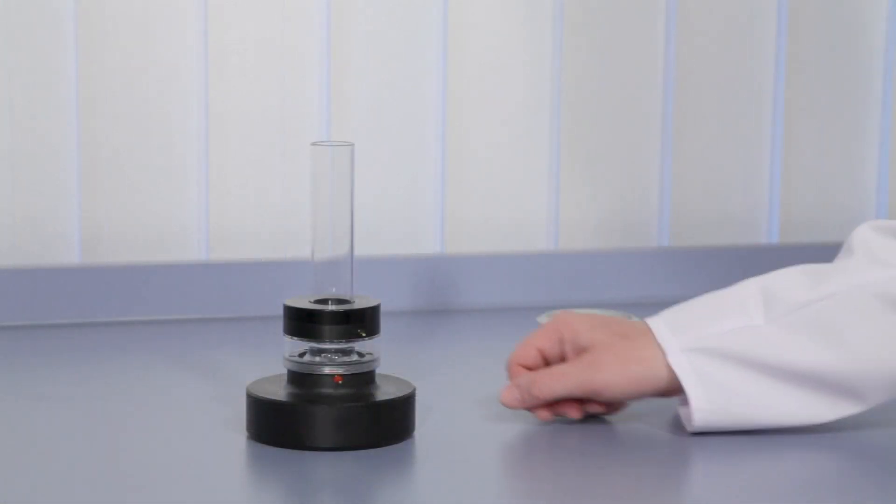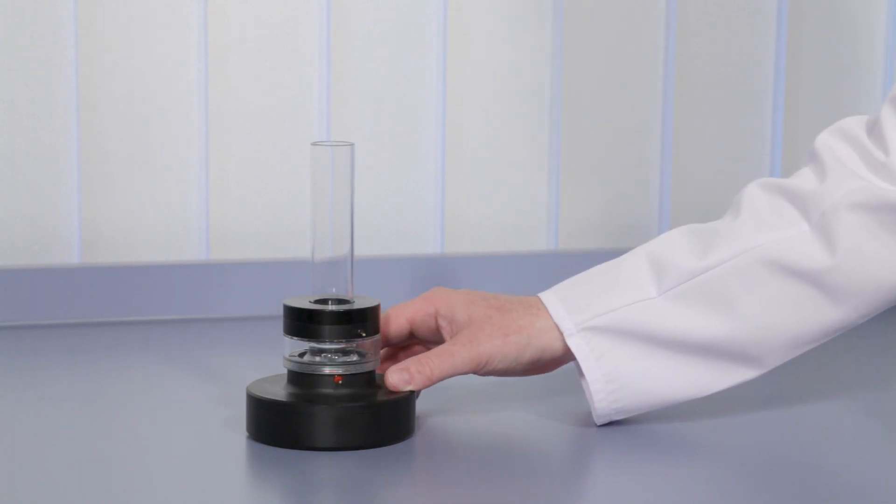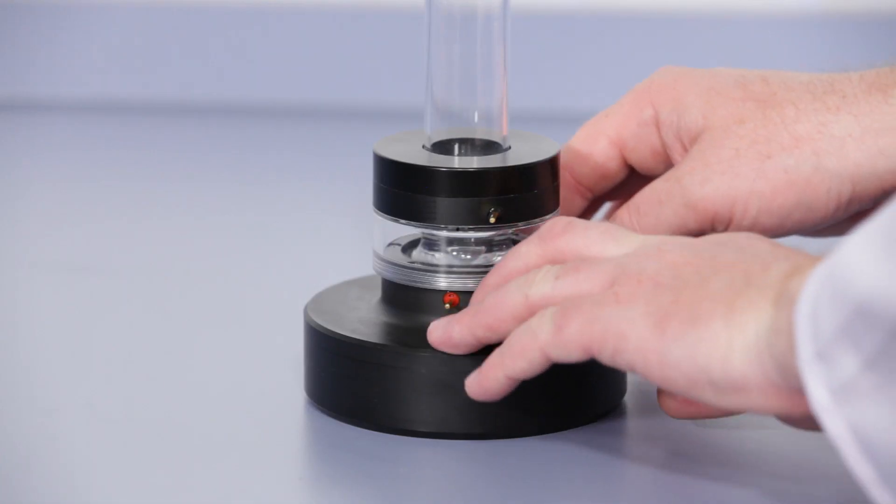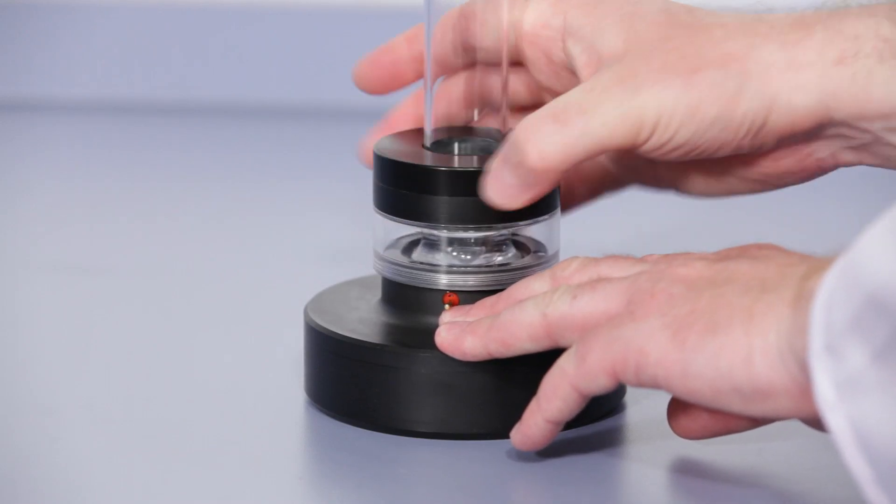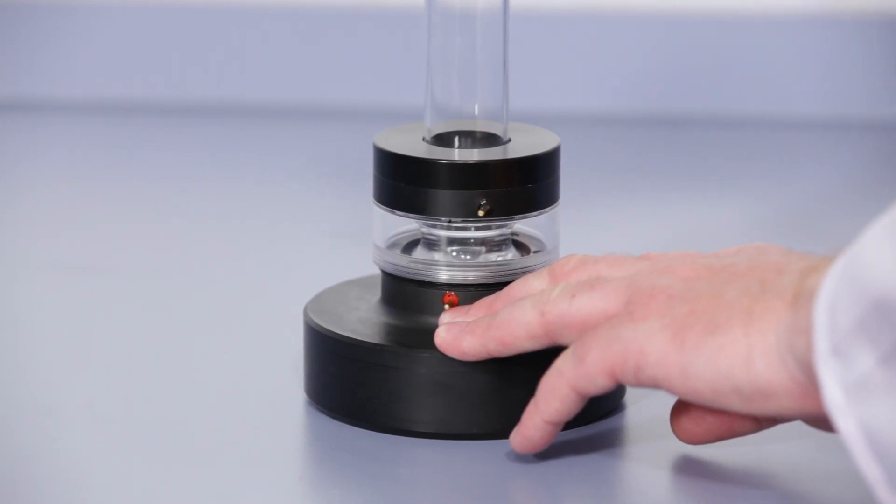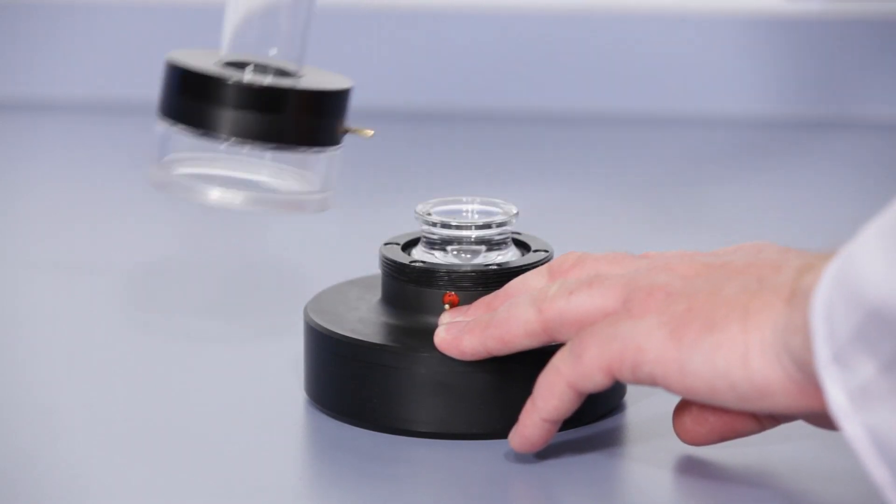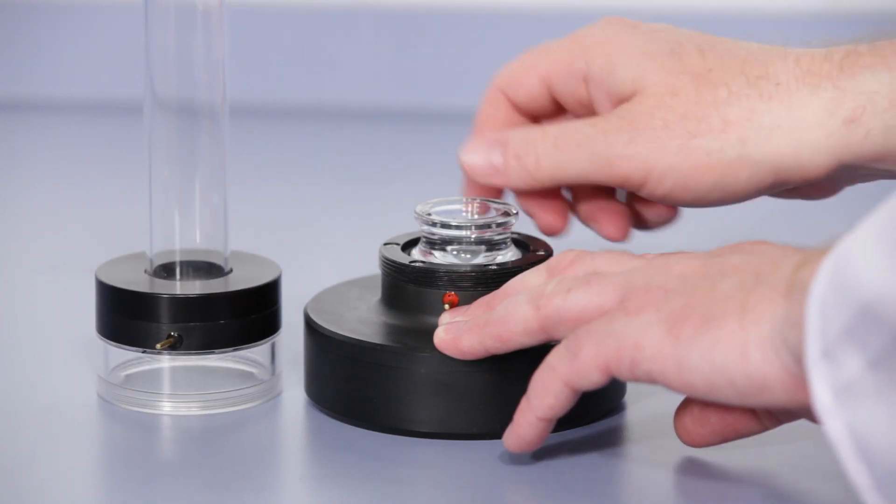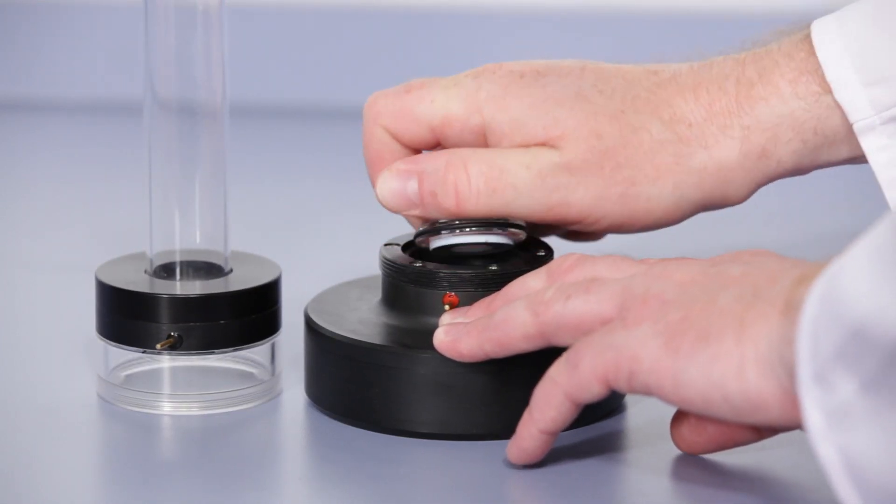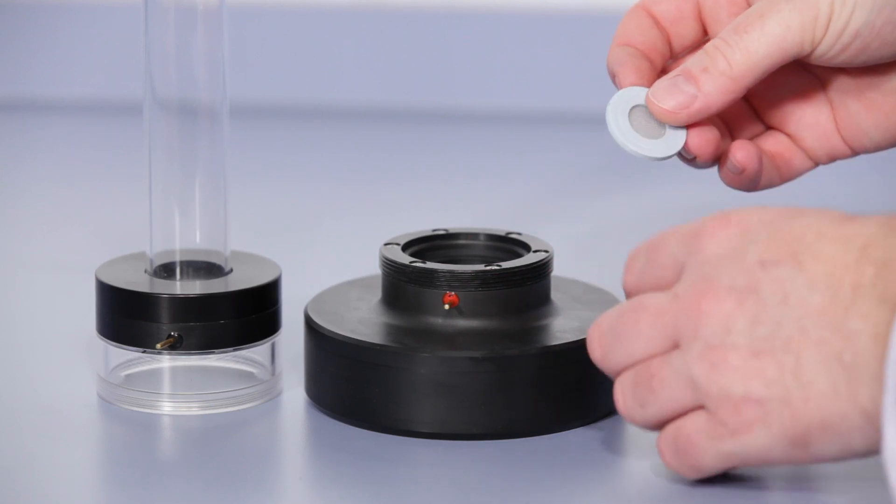To open the measuring cell, place it upside down on the worktop and unscrew the suction tube. Then, remove the adapter piece to access a plastic screen inside the measuring cell.